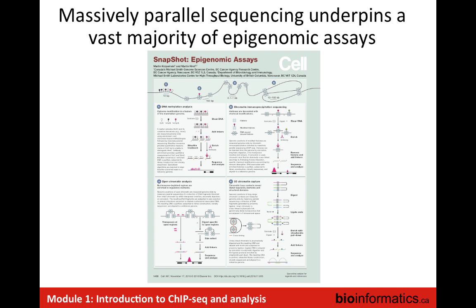So those of you who work in the wet lab as well as the dry lab, there's lots of scope for essentially generating little DNA fragments that we can sequence in various different cool ways to measure different epigenetic features, ChIP-sequencing just being one of them. We can also measure things like, of course, methylation and three-dimensional structure, as well as open chromatin using assays such as ATAC-seq, and many others. And again, happy to discuss the details of that.